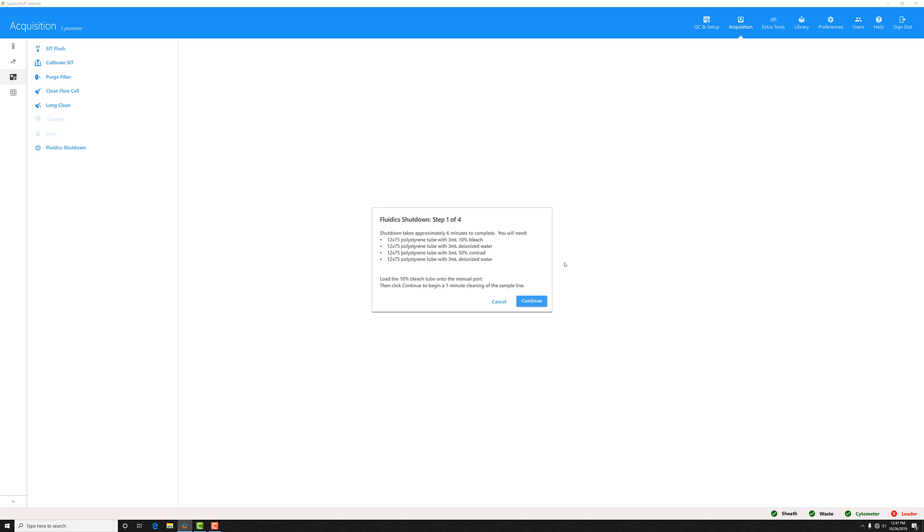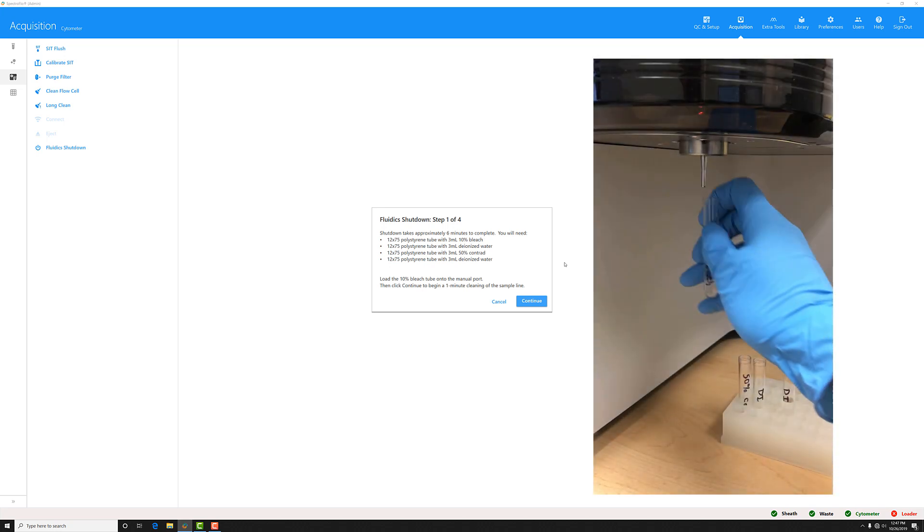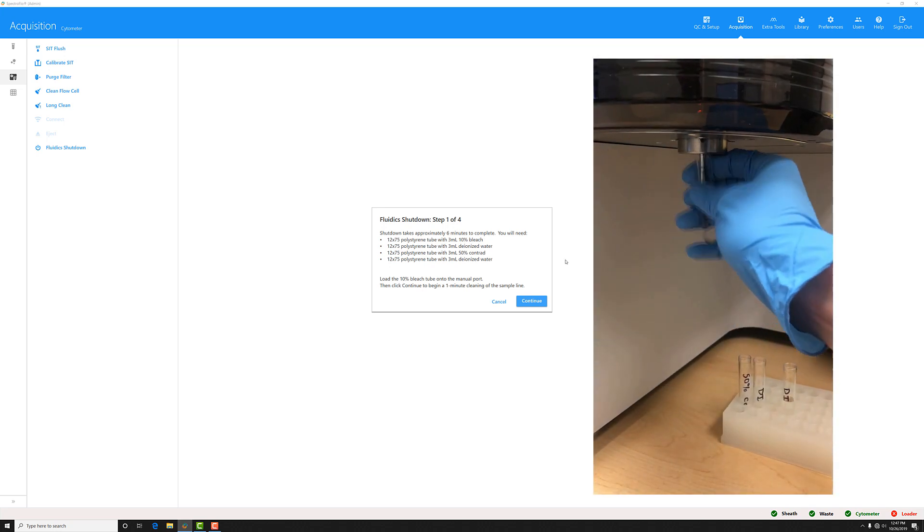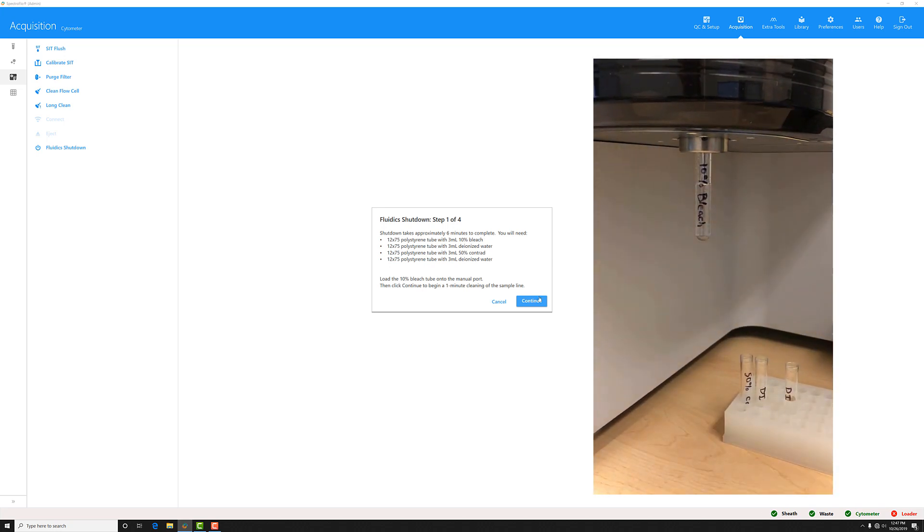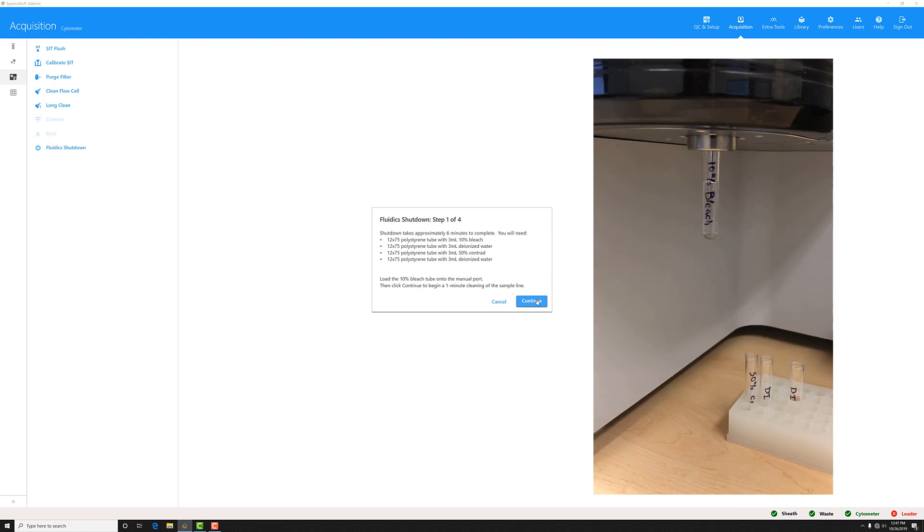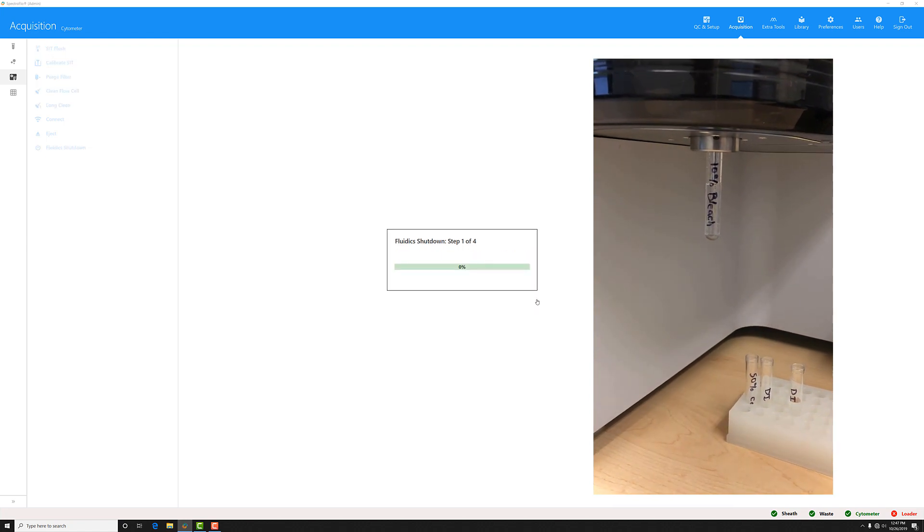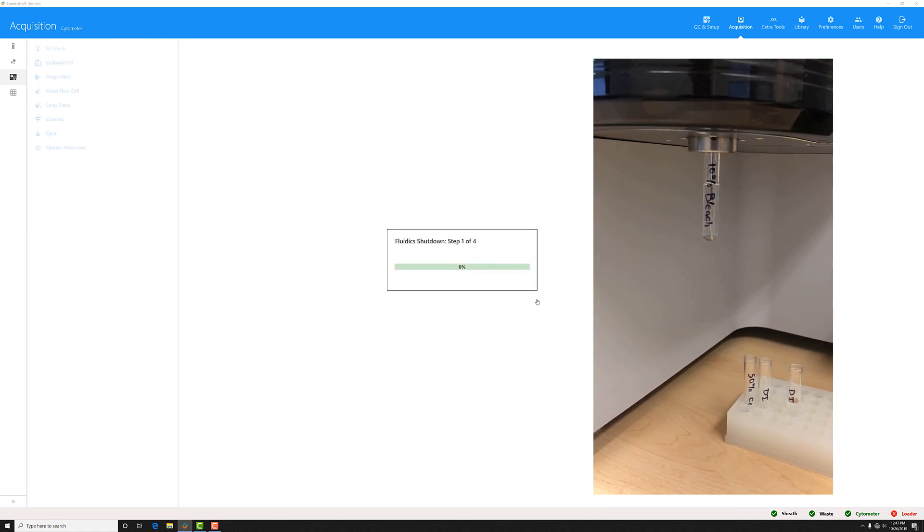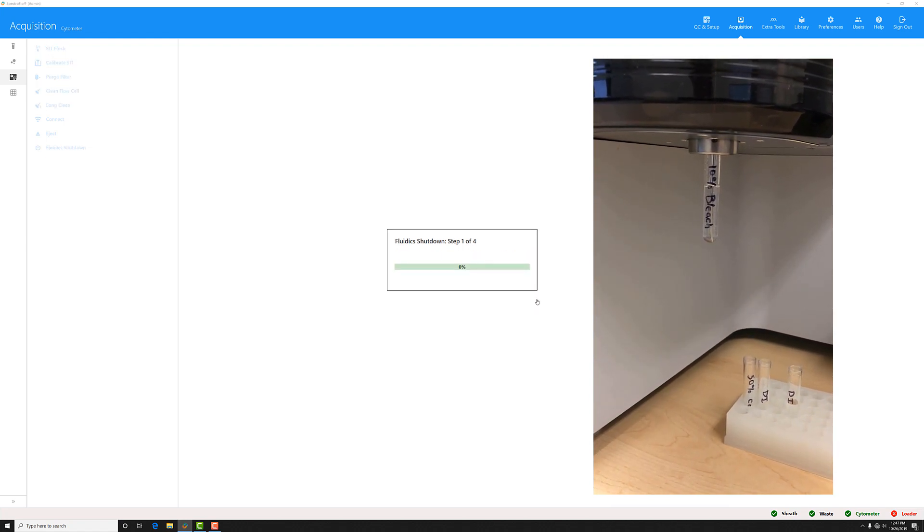First, you'll want to load the bleach tube onto the SIP. Once it's loaded, click continue, and the system will start drawing the fluid through the sample line and the flow cell.